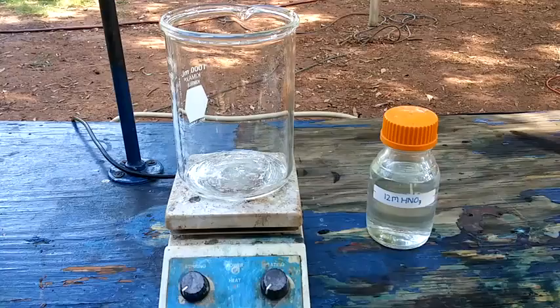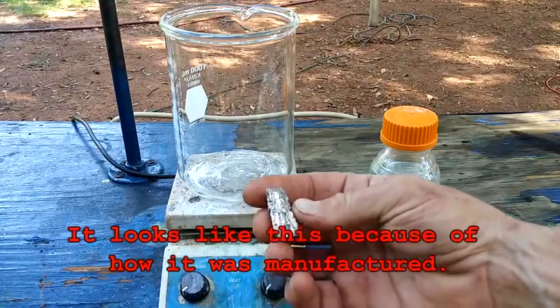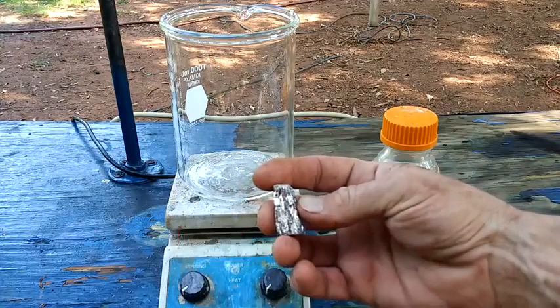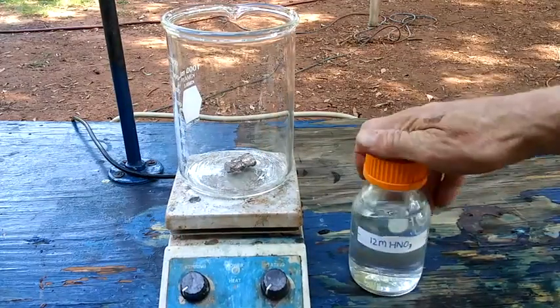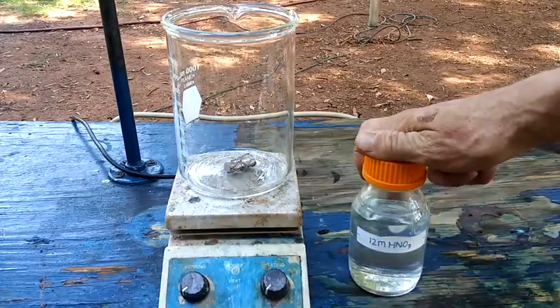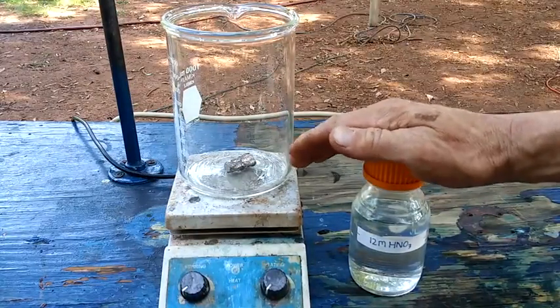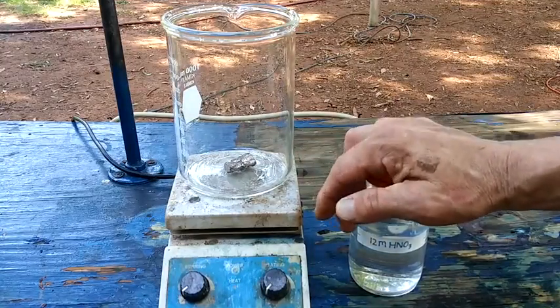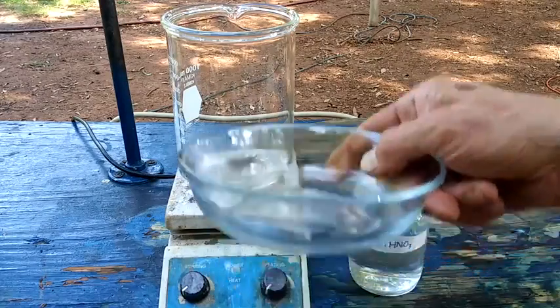Alright, so first thing that we're going to do is take some bismuth metal. In this case, I've got a 39.63 gram chunk of very high purity bismuth. And I'll put it in here. And what I've got here is some 12 molar nitric acid. And all I'm going to do is add some nitric acid to the beaker, just enough to cover that piece of metal. And then I'm going to turn the heat on high, and I'm going to cover it up with this glass bowl on the top here.